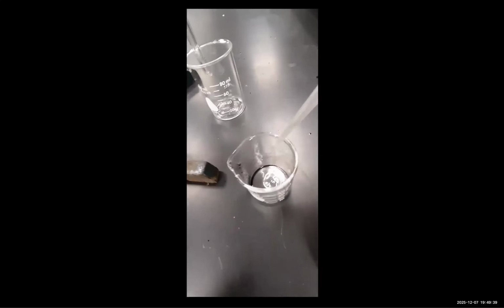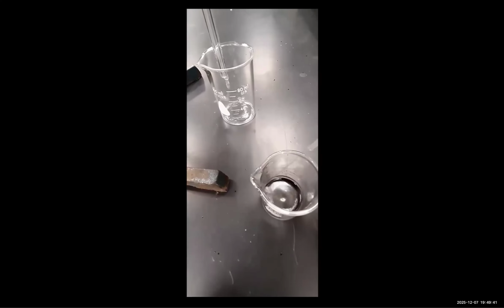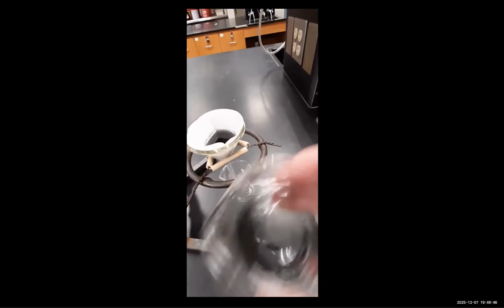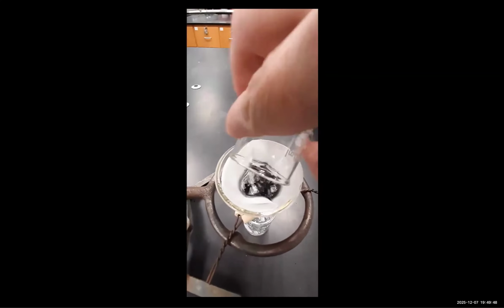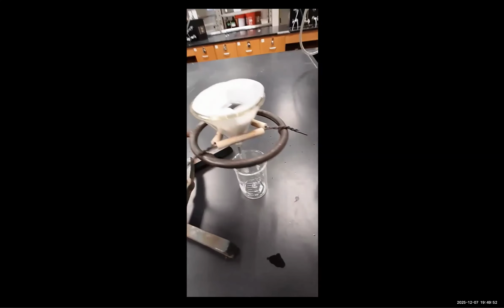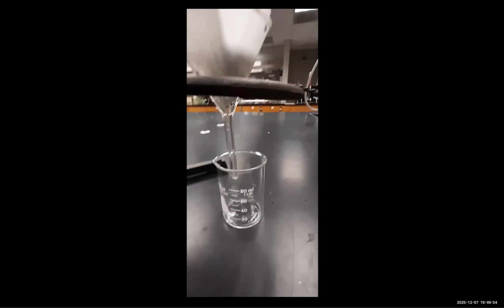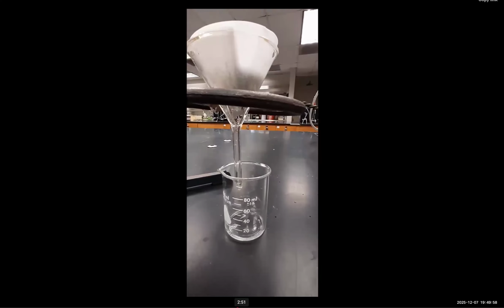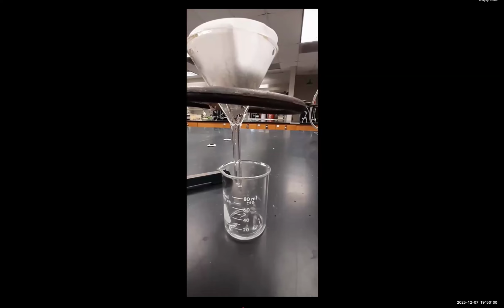As you notice, the solution we're filtering is black due to the suspended charcoal particles. But after passing through the filter, the solution is clear. So something is getting trapped on the filter, and you're going to tell me what that is. So the filtration is going to be allowed to proceed.